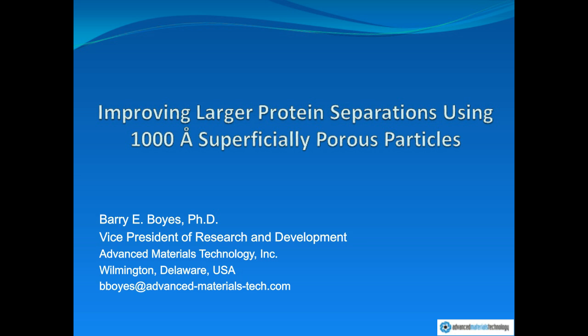The solid core actually helps to stabilize the structure, and you should not see particular problems with respect to physical or chemical instability of any properly made superficially porous particle.